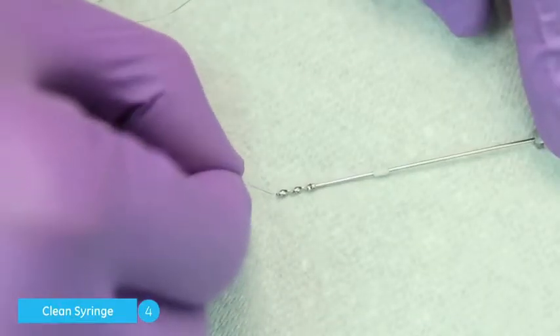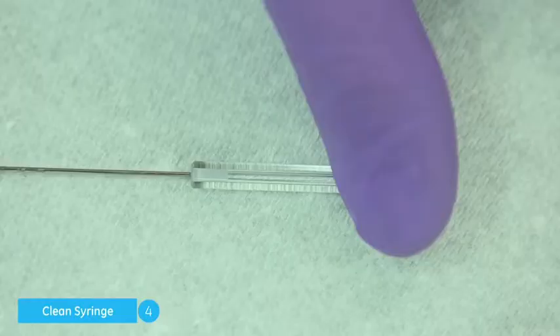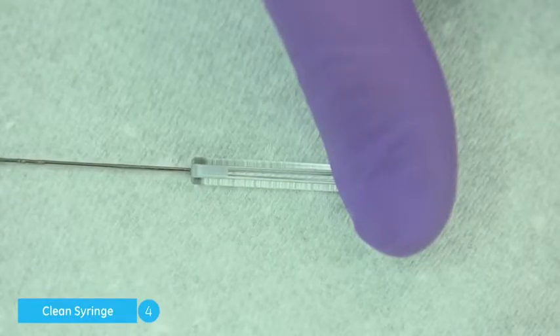Carefully insert the wire into the end of the paddle and pass it up through the stem into the syringe glass.